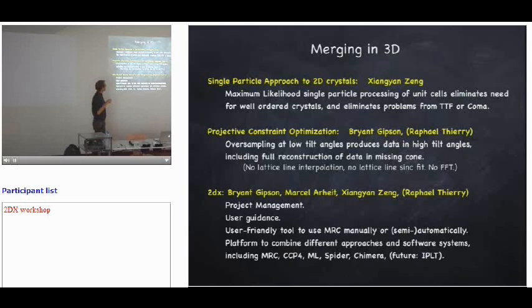And you can use that to predict what you have along your lattice lines further up, even in the missing cone. And that resulted not only in a full reconstruction of the data in the missing cone, but in a final reconstruction with a much better vertical resolution than X and Y. So he transformed the problem of the missing cone into a better Z resolution than X and Y. And I will present tomorrow how he did that. It involves that he does away with sinc interpolations. He uses more complicated functions, and he doesn't use Fourier transformations anymore. He uses matrix algebra.